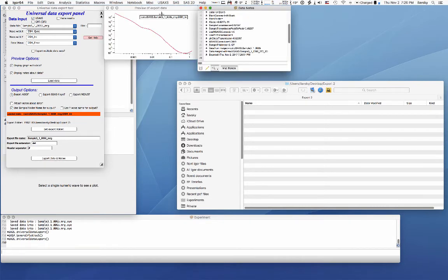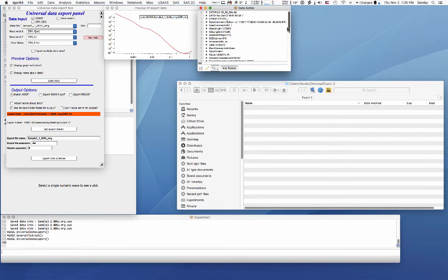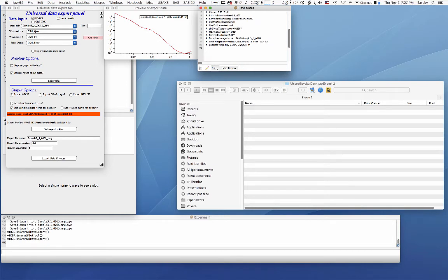You do this, it will show you a graph of the data you're going to export. It will show you what notes you're going to append to it if you're going to append them, but it allows you to look through it.